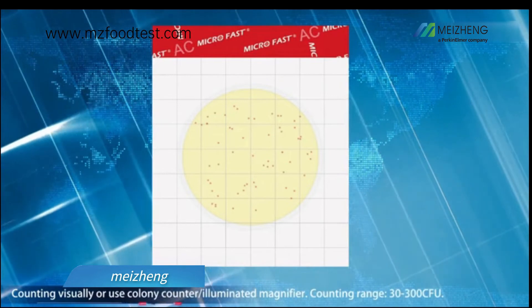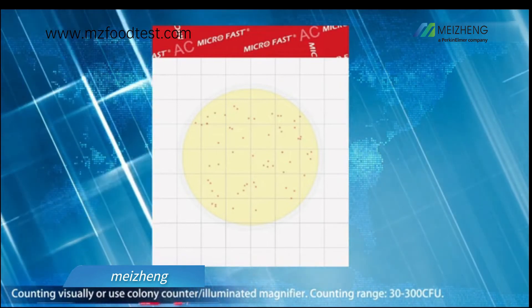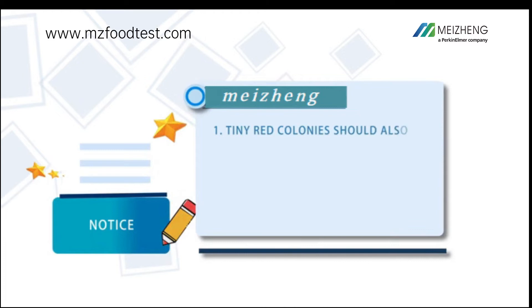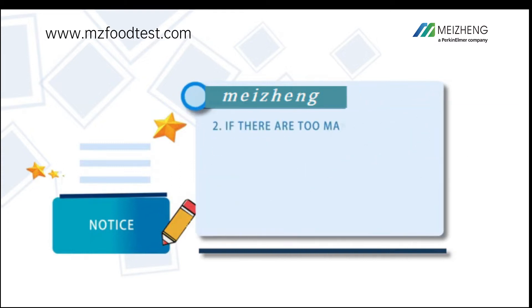After incubation, bacteria will show red colonies on the count plate. Count visually or use a colony counter or illuminated magnifier. The counting range is 30 to 300 CFU. Note that tiny red colonies should also be counted. When there is obvious colony dispersion, a massive dispersion is recorded as 1 CFU.